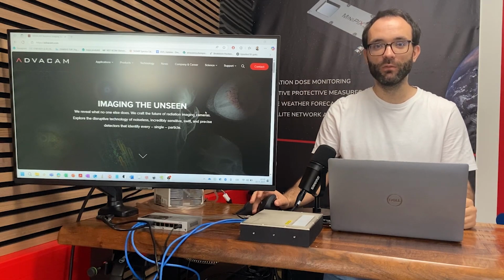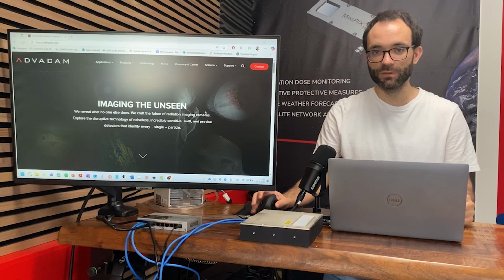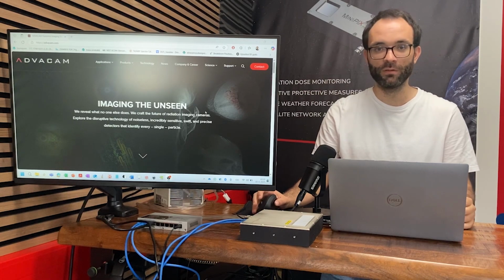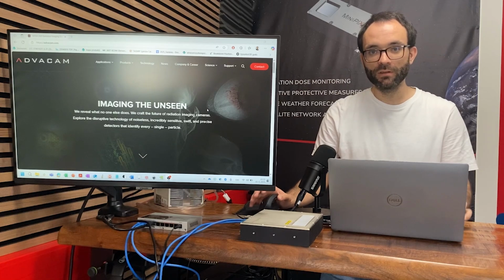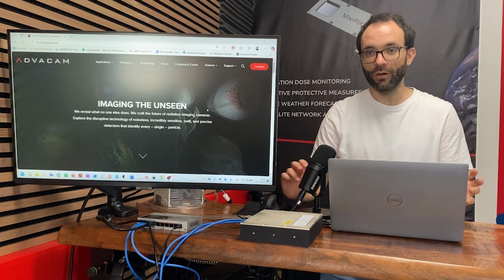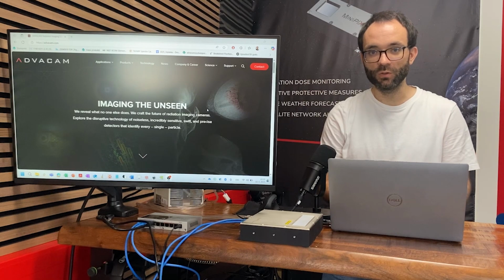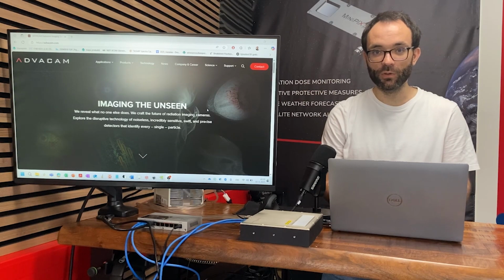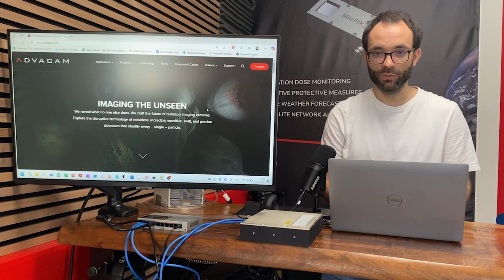Hello, I'm Jan from Advacam's technical support, and today I will show you how to establish an Ethernet connection with your WidePIX device. So in general, after you plug in all the cables for the chiller and for the power, you need to set up the network correctly for the WidePIX to communicate with your computer.